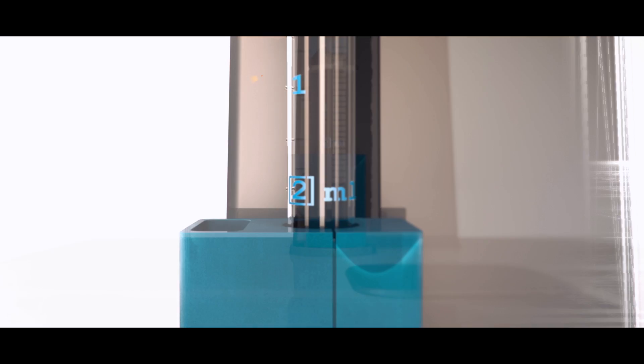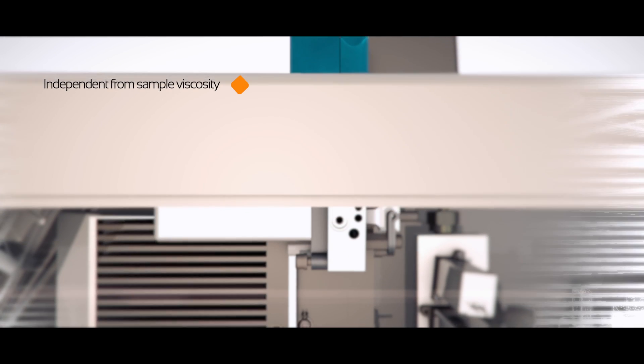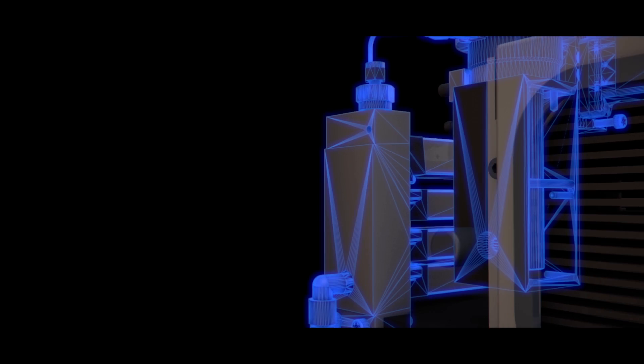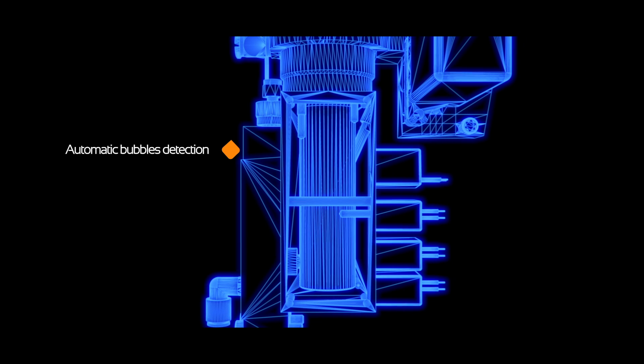Unaffected by viscosity, samples are injected vertically by an automatic push piston, while an intelligent detection device automatically tracks any bubble present in the measuring cell.